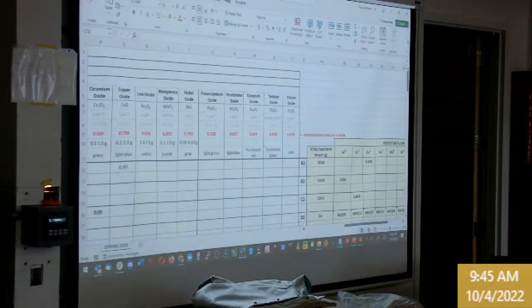The way that you will operate this is that if the glass disc is being poured here, you light and then move in from the side. There's a strand of glass. I'm not going to flame my finger here, but you will be heating that strand of glass about an inch away from the tip of the torch to keep that the hottest part, because we want to prevent stringing glass everywhere, which can happen. So that also helps me separate the crucible from the disc of glass. As soon as I pull the glass away, you then take that torch and you'll be torching the surface of that glass about an inch away.